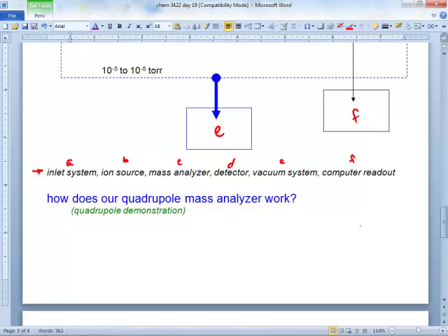All right, this guy. What is he set for? Emily, what are you looking for? What type of ion? What mass? Are you looking for something really light or something really heavy? Okay, she set these guys to a very light mass. Fine. Okay. So now you're a molecule though. So you really are looking like this, right? This is a molecule. Even though it looks like a bunch of different things, those are the daughter ions.